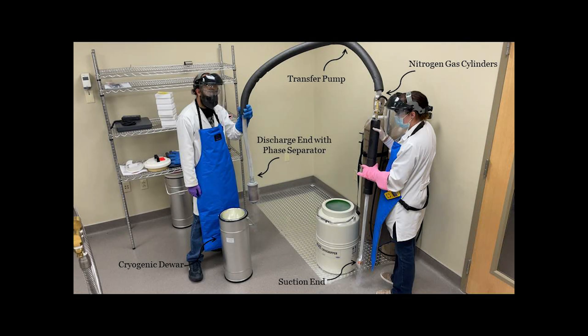At CSSI MMW, we use the MVE liquid nitrogen transfer pump to transfer all remaining freestanding liquid nitrogen from the cryoshipper into a cryogenic dewar. To utilize the transfer pump, you need nitrogen gas cylinders to create a vacuum for the pump to function. Make sure you also have a two-stage pressure regulator to control the flow rate of the transfer.